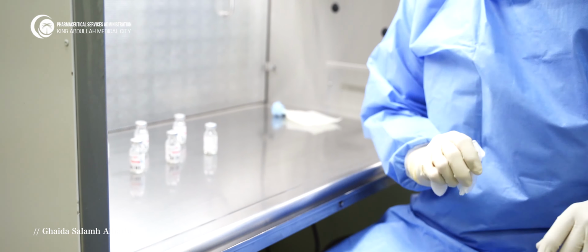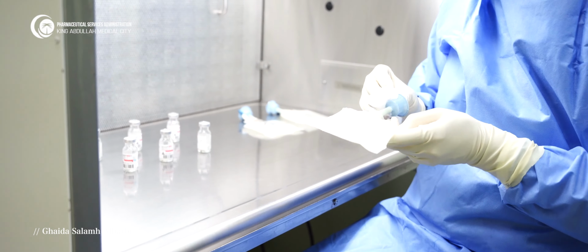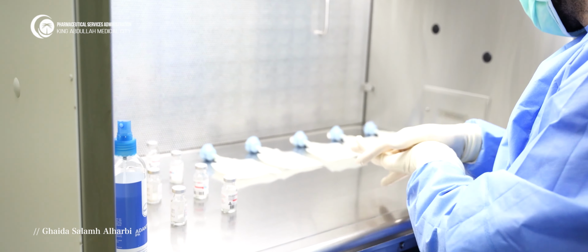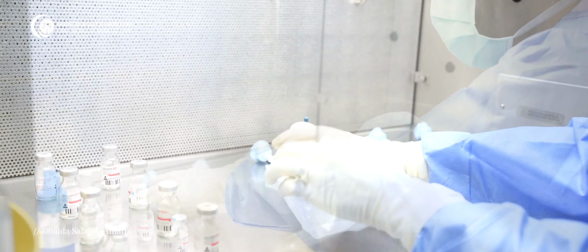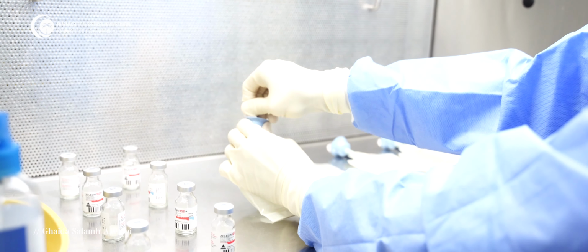We'll arrange the mini bag inside the hood in an order which does not block the air, the first air, to be in contact with the critical sites, so we will not overcrowd the hood.